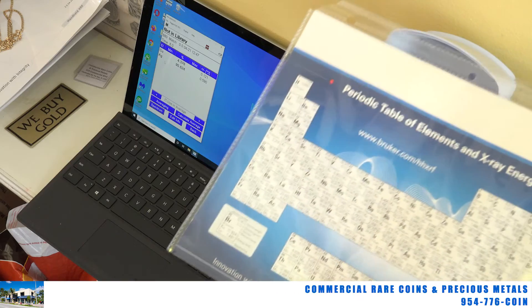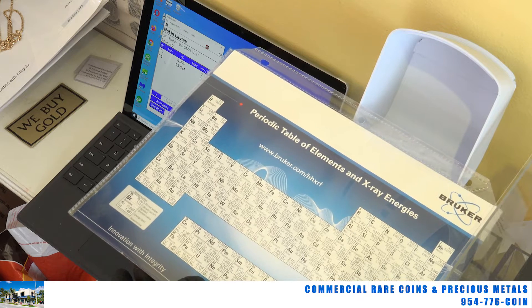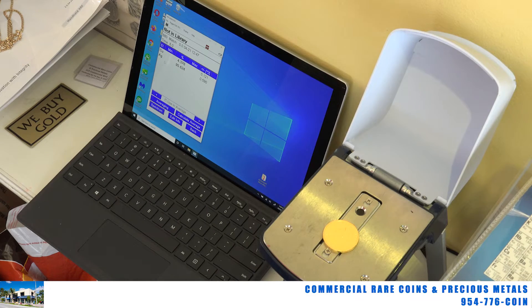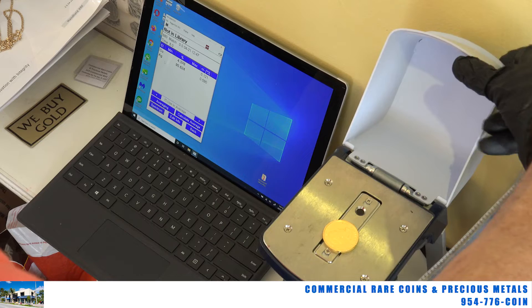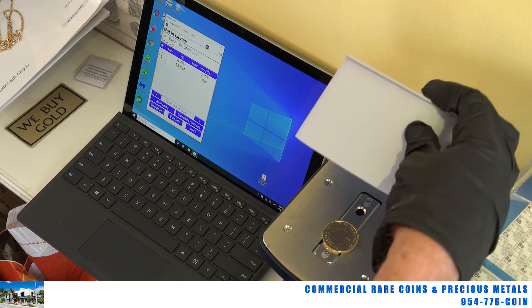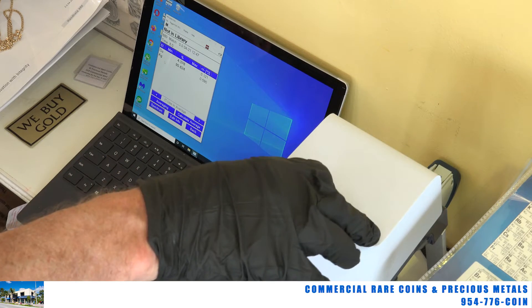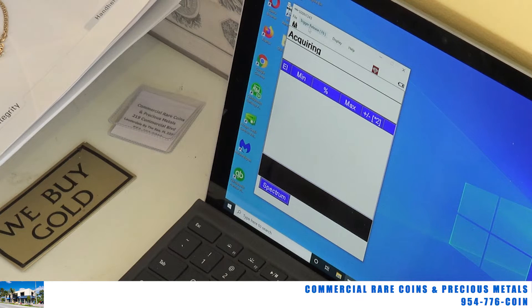There's a periodic table of elements right there that we use, showing all the different elements we'll be looking for on our screen. I'm going to put the coin over the window, close the lid on this, and we're going to shoot it. This is x-ray, so this is a heavy steel lid that keeps things safe. I'm going to pull the trigger right here, and you'll see that it's acquiring.